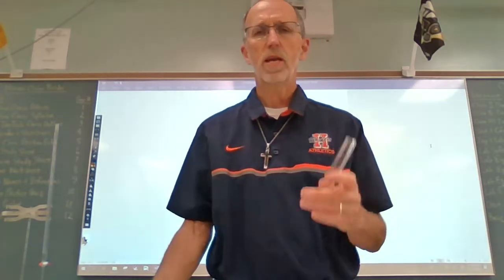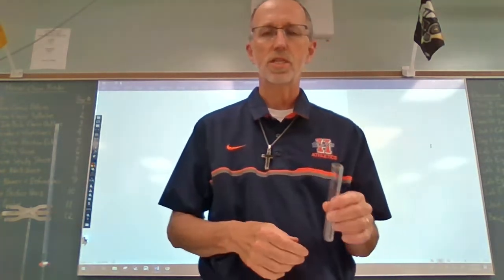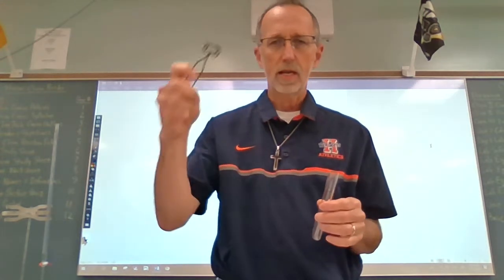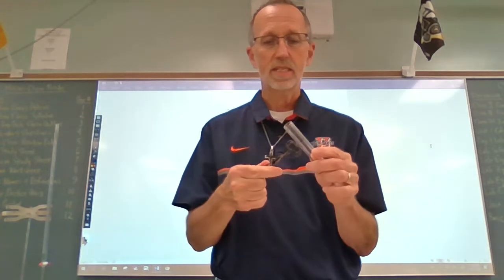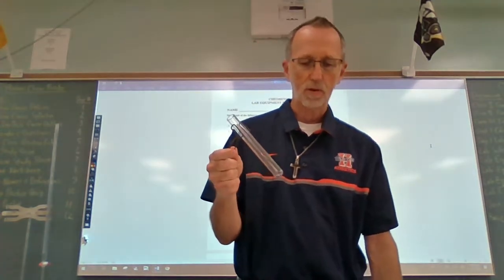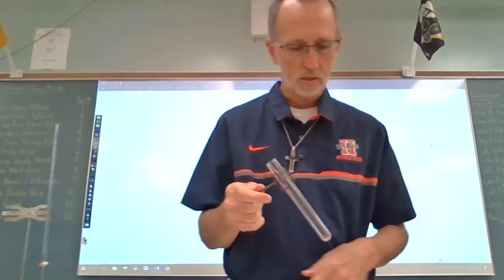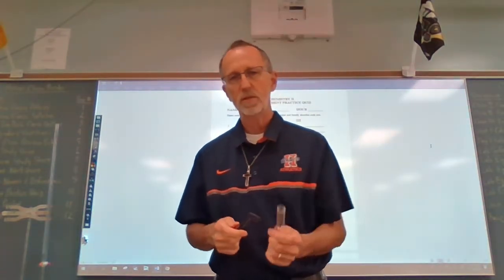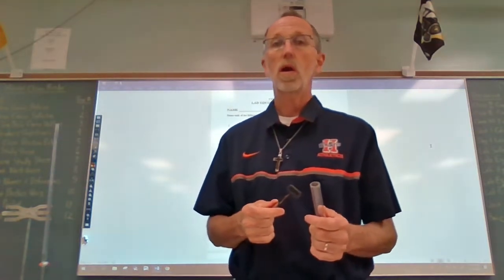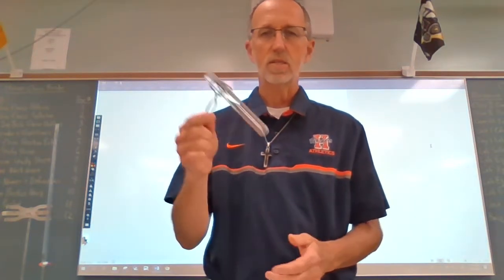If you're just pouring a liquid or a solid chemical with a spatula like we just showed into here, you're probably not going to need this. But if you're heating something in this, you are absolutely going to need a test tube holder. So number 11 is a test tube holder used to hold a test tube. Number 12, the test tube is used for mixing or heating chemicals. When you get to the heating part, that's when you want to use a test tube holder.